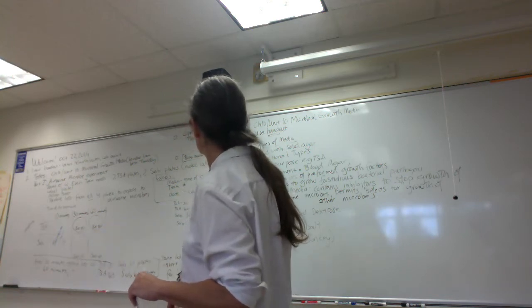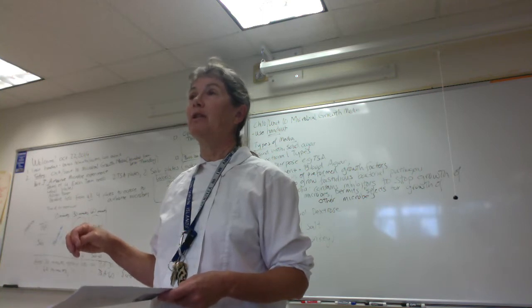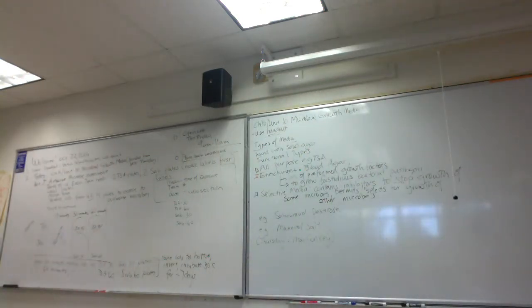Then folks, enrichment media. Enrichment media, we take a TSA, an all-purpose medium, and we're literally going to add blood to it. So, folks, blood agar appears in contrast to the TSA, what color is the blood agar? It's red. Why is it red? Why is blood agar red? Does it have red blood cells in it? Erythrocytes, right? And what color is hemoglobin when it's oxygenated?